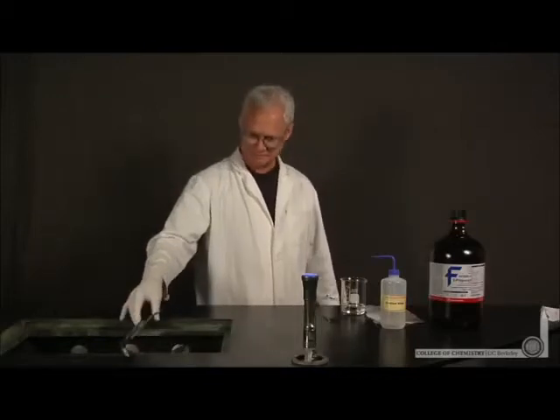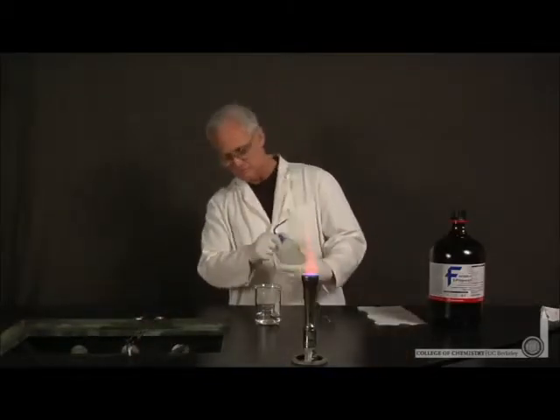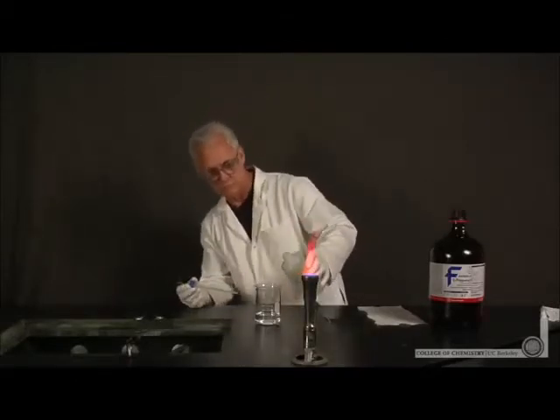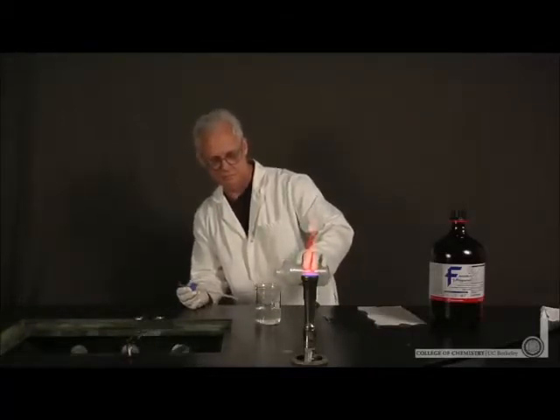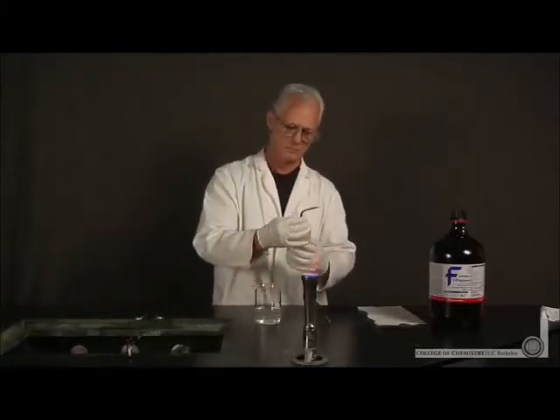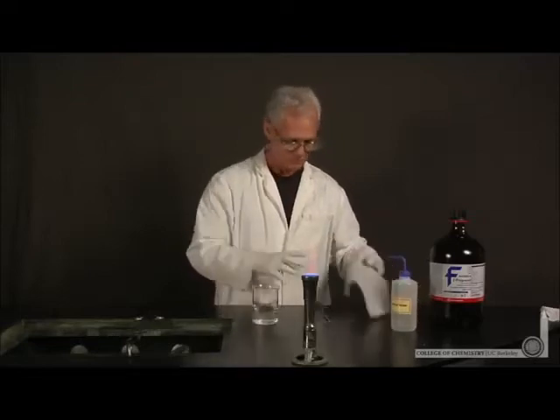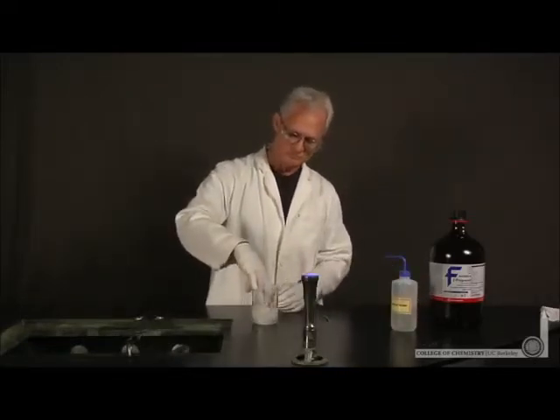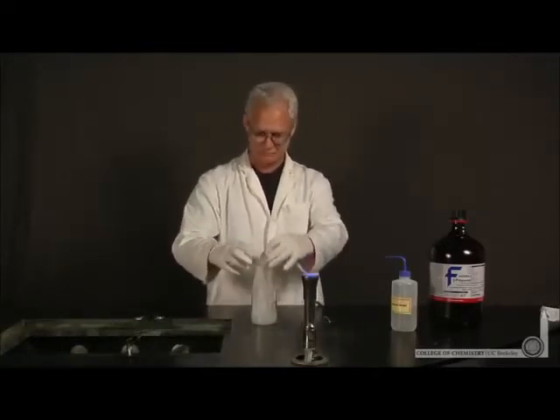Now what would happen if we added water to that isopropanol? An isopropanol water mixture, will that burn? Well, let's do the experiment. Here's Lonnie going to make a 50-50 mixture approximately of isopropanol water and burn that in a saturated towel. So he has half his towel left over. Puts that in his isopropanol water mixture, and let's ignite that with a torch.